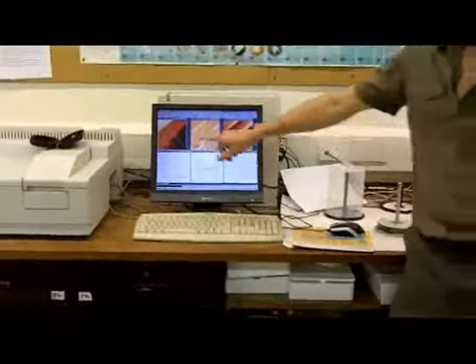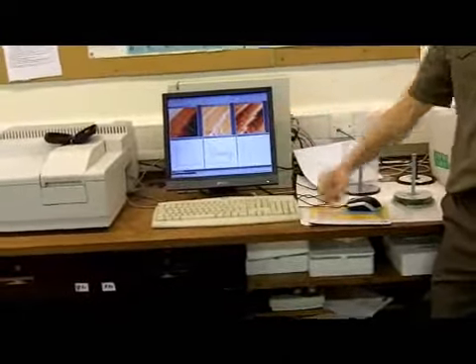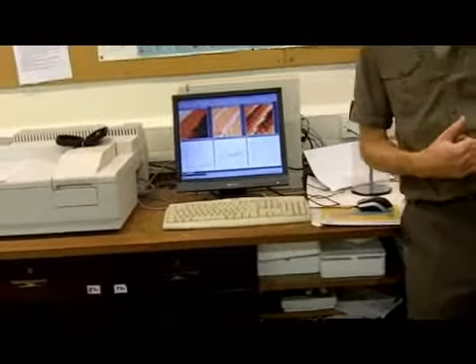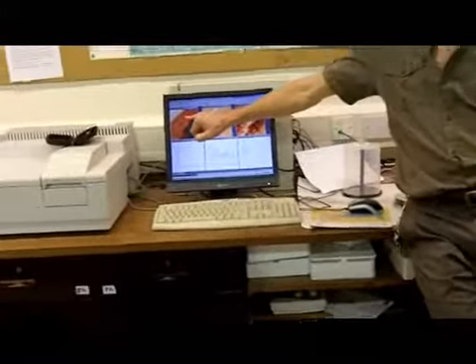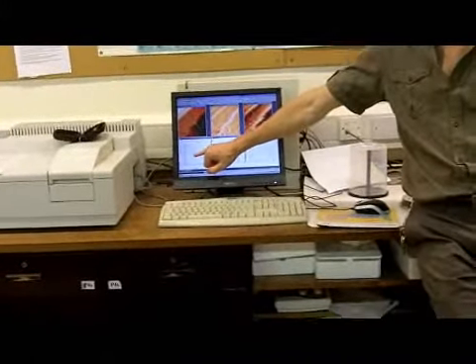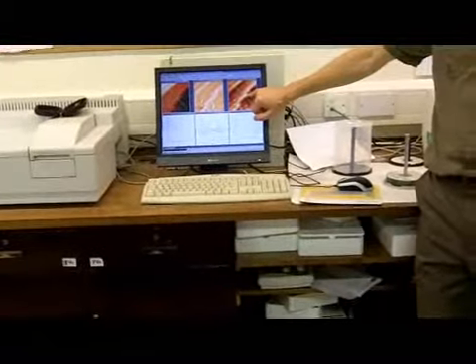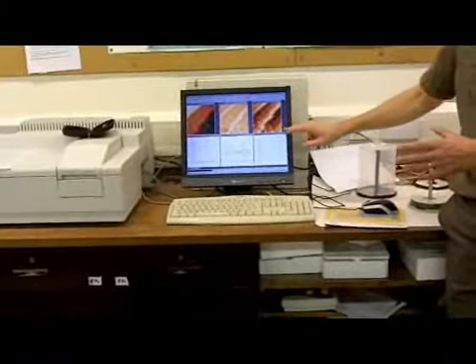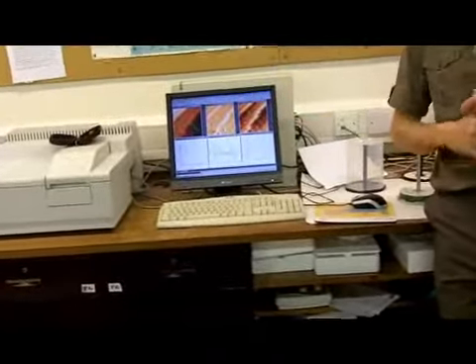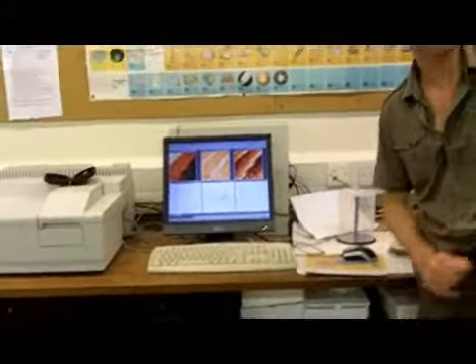The thing is though, that image looks horrible. And this image looks much better. So in your report, you want to think about what's going to create the best impression. And it's not really that image. You definitely want to report this profile, but you probably will want to report this image too. And that's fine, because we can see what features this profile is going over. We're not deceiving anybody, but this is giving you the accurate information.